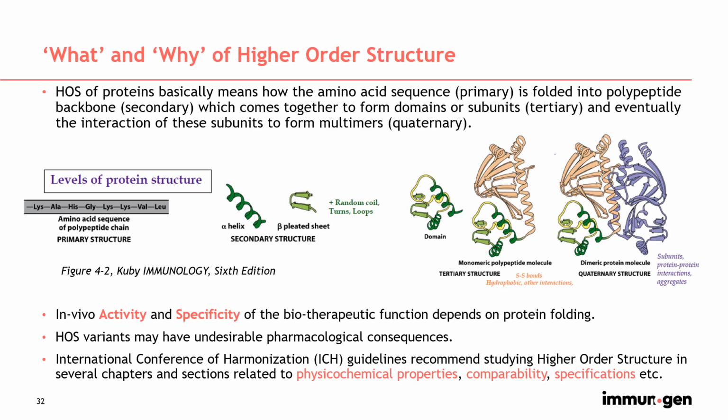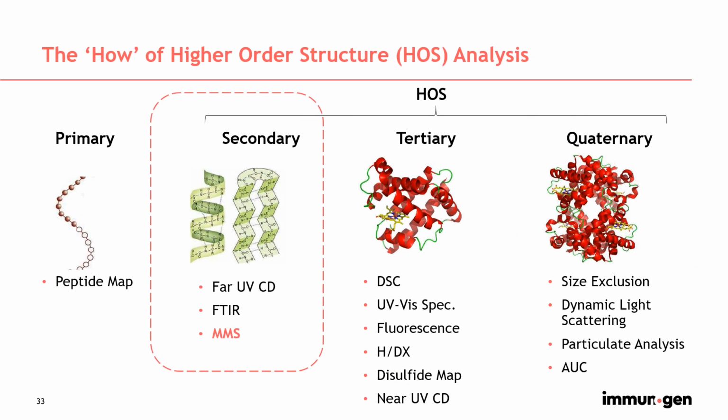These are the reasons why ICH guidelines recommend studying high-order structure in proteins in several sections related to physicochemical properties, comparability, specifications, etc. This slide shows the commonly used techniques used to study the different levels of protein high-order structure.